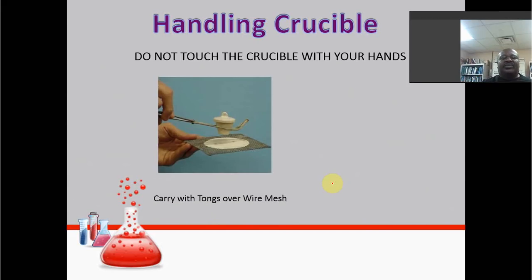So here are the crucibles that you're going to work with. And mind the price of these, so be careful. I think $10, $12 for the cover, similarly for the lower component. But anyway, this is how you transport these things, especially when they're hot. The hand there with wire gauze just provides additional insurance in case anything slips, so you can catch it before it breaks.